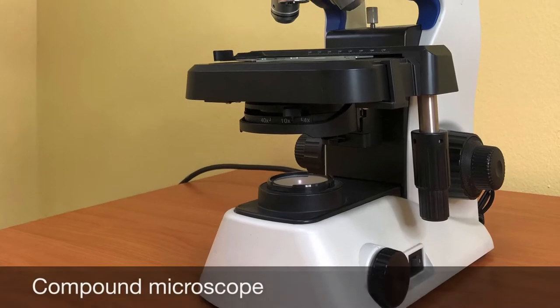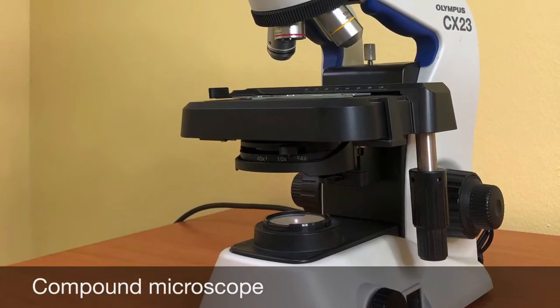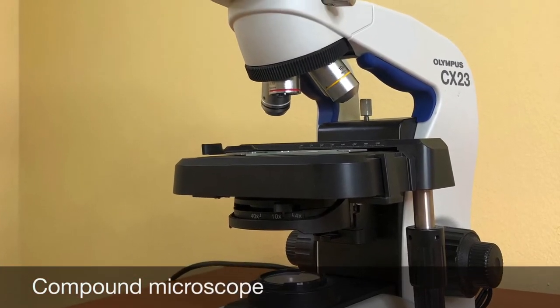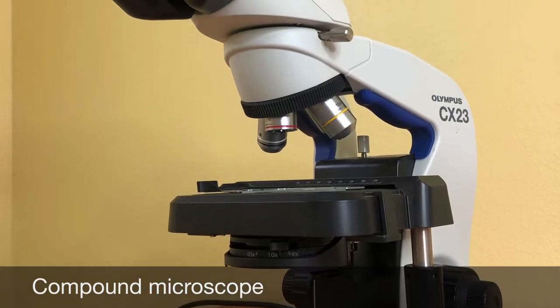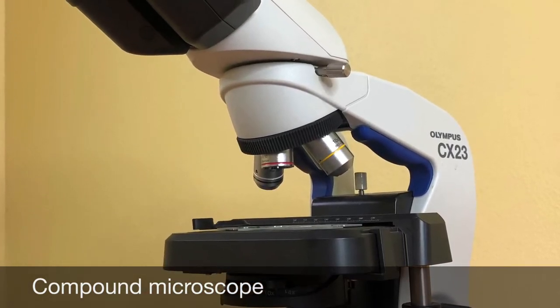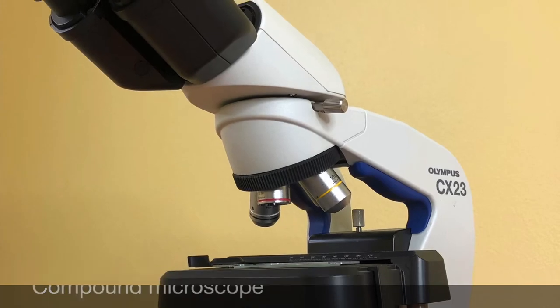Let's move on to see the major parts of the compound microscope and their functions. While watching this section, you should be completing your lab report.